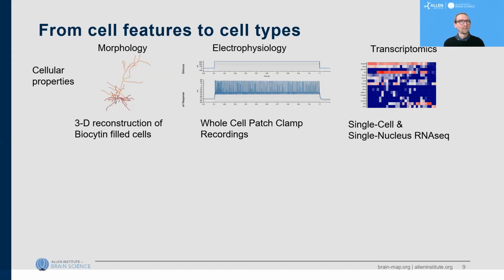We also carry out single cell sequencing of bulk tissue that we don't have the other modalities available for, which lets us, for transcriptomics alone, get really large scale data sets in the tens or hundreds of thousands of cells.